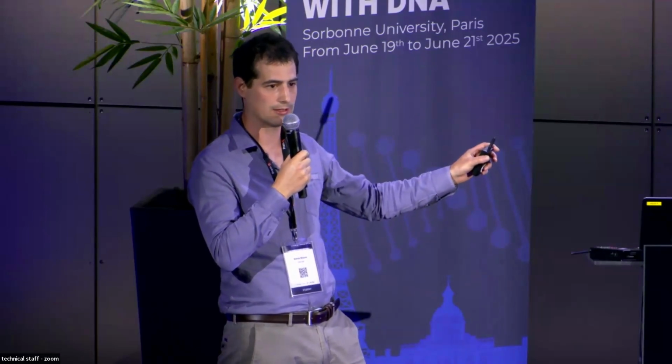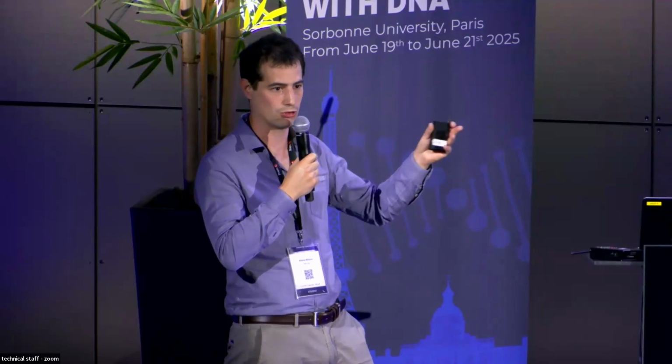Yeah, this is not a trivial question to answer. I'm also not an ASIC person, I'm a biochemist. What I gather is that for this, it's likely you will need a non-standard process. Of course, if you need to integrate it as well, because a part that I didn't show here is that you actually need a separate memory array to store your frame of data that you're pushing to the synthesis array.